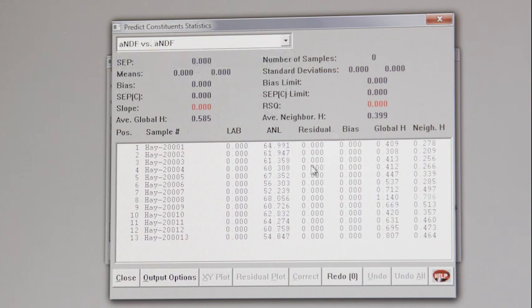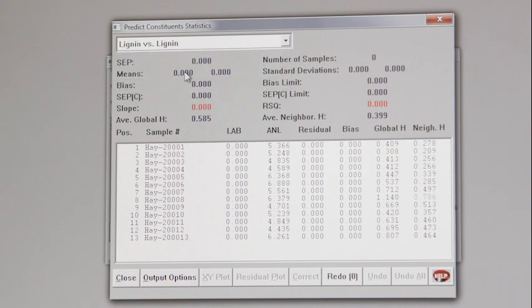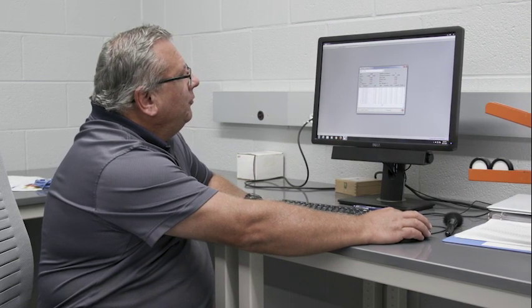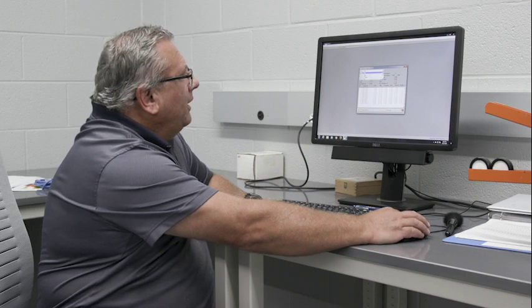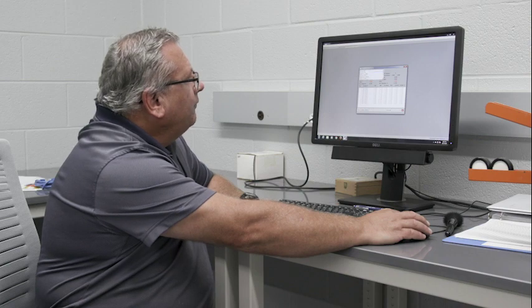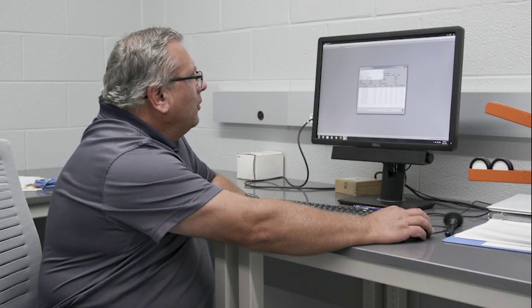These are the results. In this file we have 13 samples — the 13th is the sample we just scanned. Each window shows a different parameter. This one shows dry matter: we've got almost 92% dry matter in this particular sample. We can go down to crude protein: about 11.5% crude protein. And there are a whole bunch of different constituents on this list — digestibility, fiber content, and more.